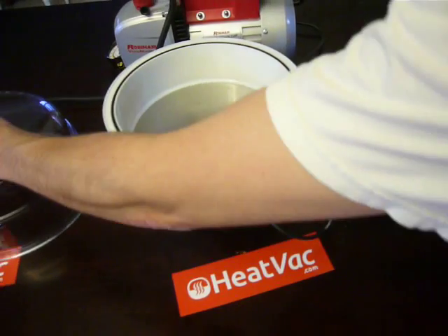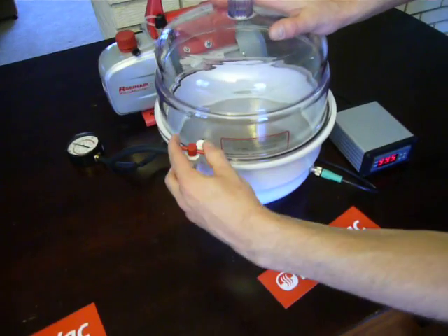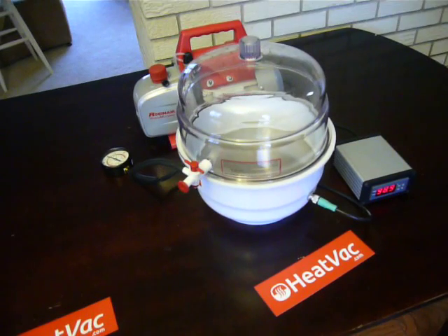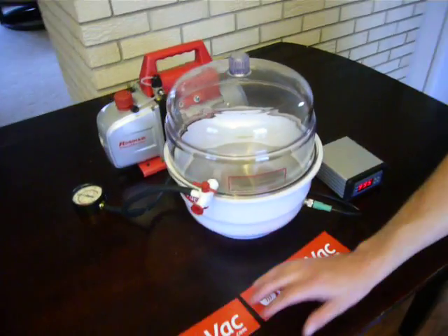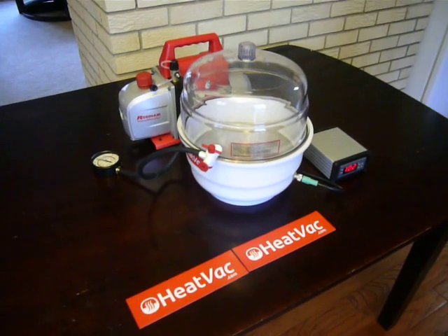Everything is hooked up. The next step for someone who wanted to use this would be to make sure the valve is in the right position, turn the pump on, and go ahead and evacuate the air. That's all for our setup video. Thanks a lot for watching, thanks for visiting the website, and thanks a lot for your interest.